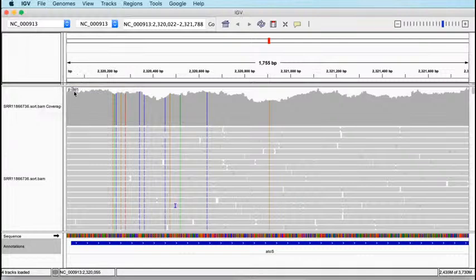You can see that in this particular window, this sizes dynamically, it ranges from 0 down at the bottom to 167. So there's quite a range, although actually mostly the coverage seems to be around about 140, 150 fold across this region. But you can see how it varies across this region.